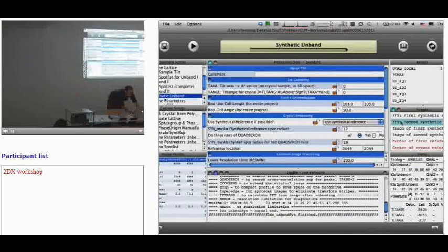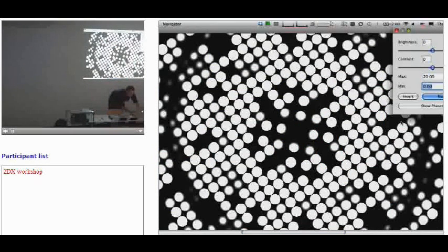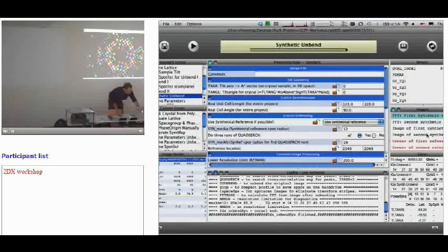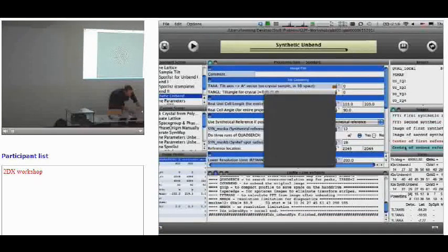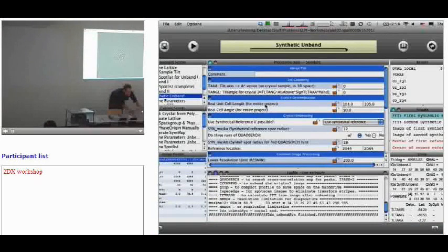And we even make 2 of them with 2 different diameters. The first one has a small diameter, and the other one has a larger diameter. And so these are now larger than before. So we have 2 because the first one corresponds to a large reference of 7 by 7 unit cells, and the second one corresponds to a smaller reference of 4 by 4 unit cells.